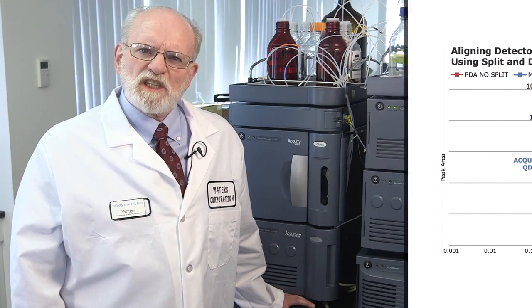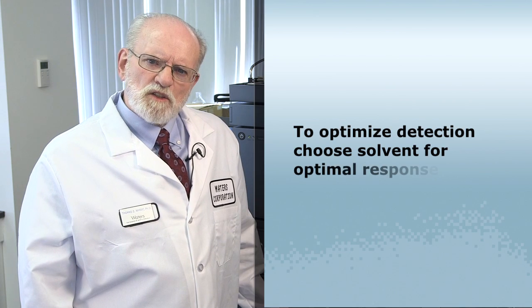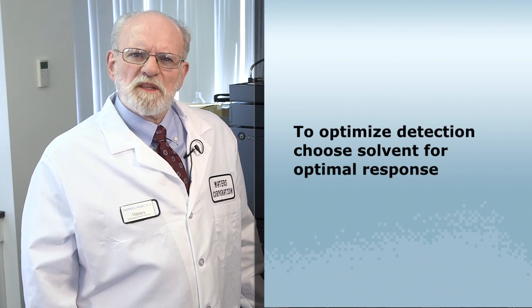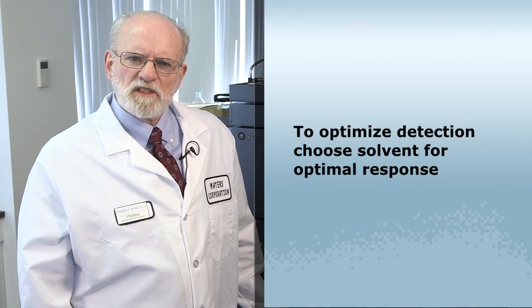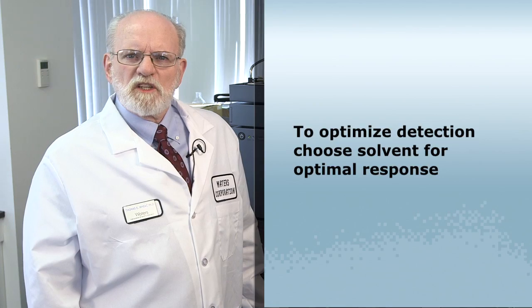Now that we have successfully aligned sensitivity between the MS and PDA, an additional option is available to optimize detection. Since the split and dilute approach requires a makeup liquid, we can choose a solvent that gives the optimal response in the target detector. Here we're focusing on the ACQUITY QDa MS detector.